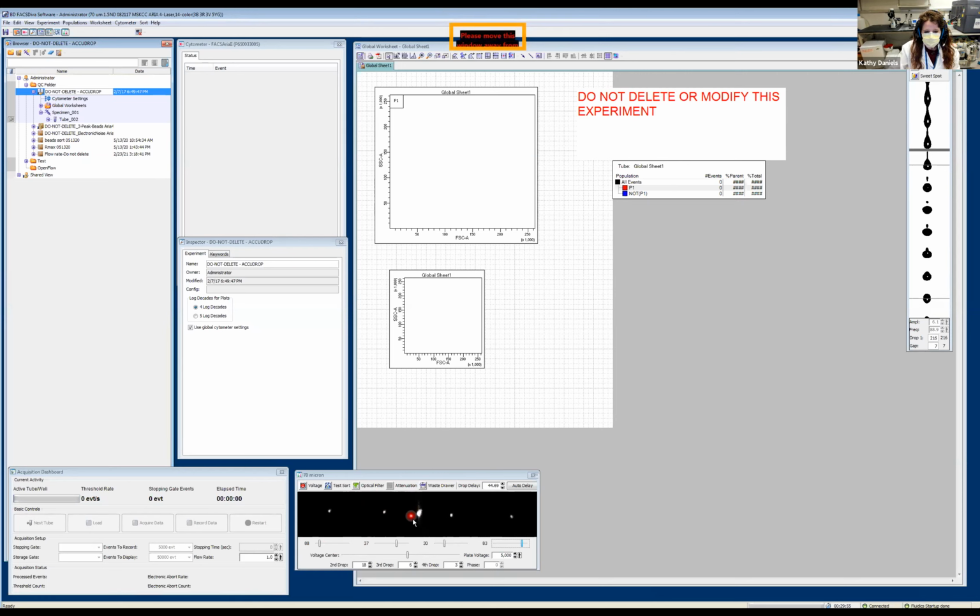what I'm then going to focus on is this center waste stream, okay? What winds up happening is that we have this second, third, and fourth drop, which is applied to correct for any fanning that there might be in the center stream as a result of these other droplets that are being deflected, okay?